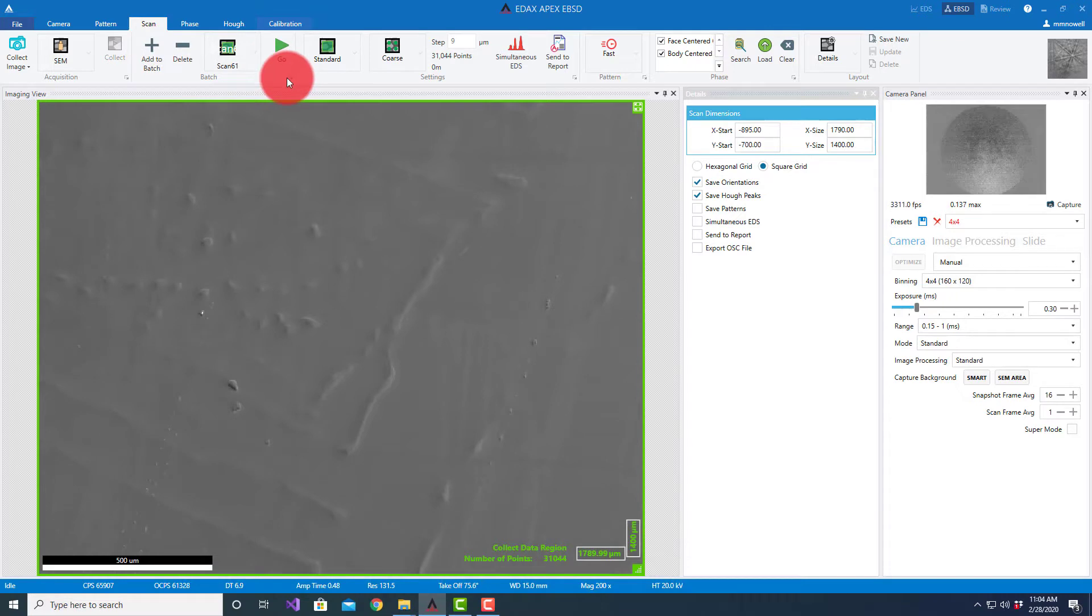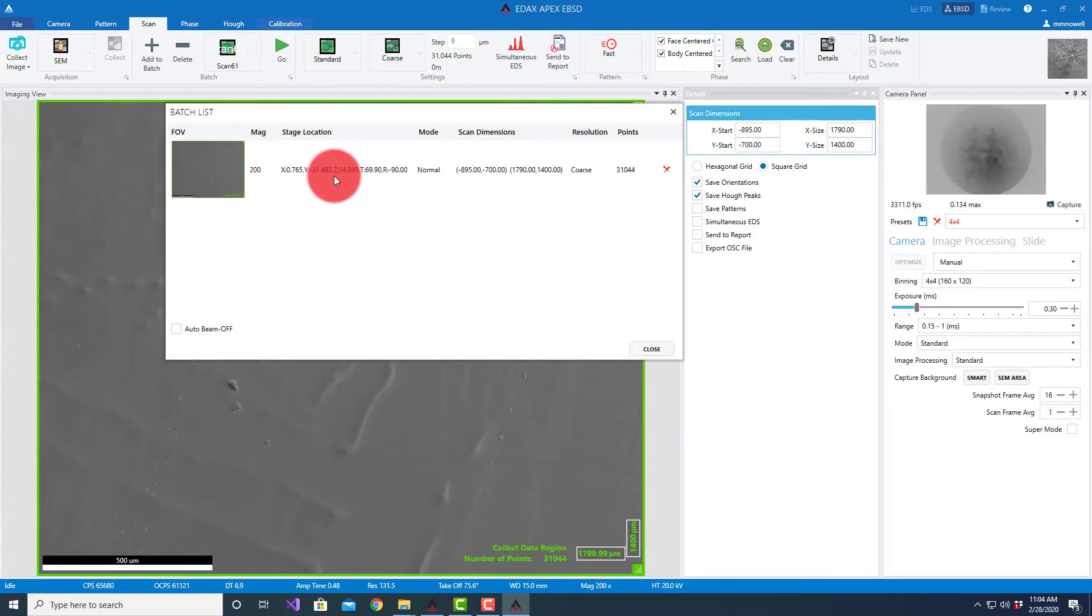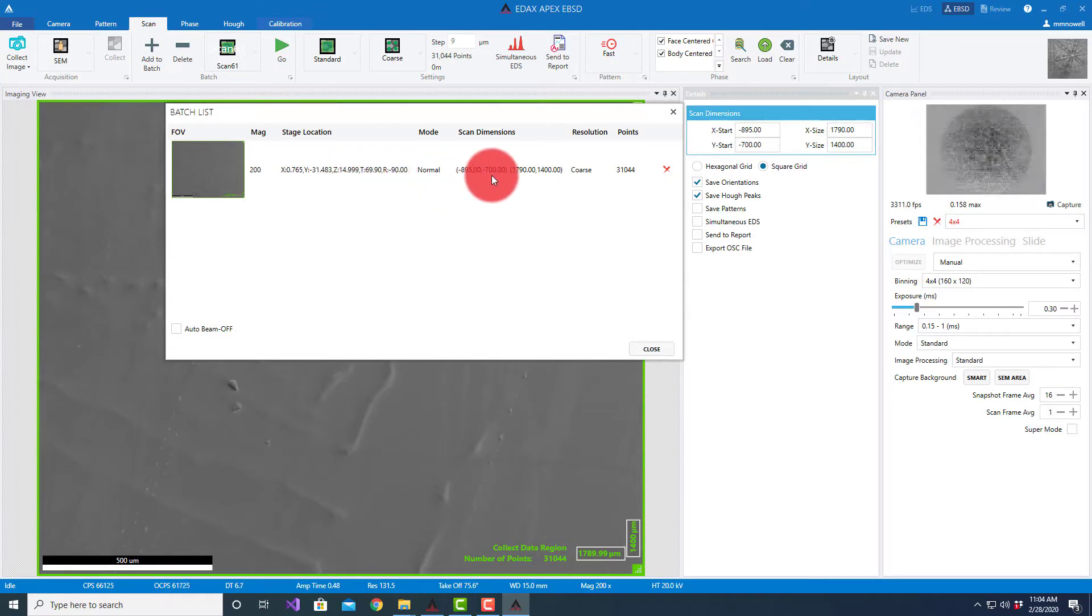That's going to create a batch list here. I can come down here and it shows me the first scan at a magnification of 200X, my stage location, the fact that I'm in normal mode, my scan dimensions, my resolution, the number of points.